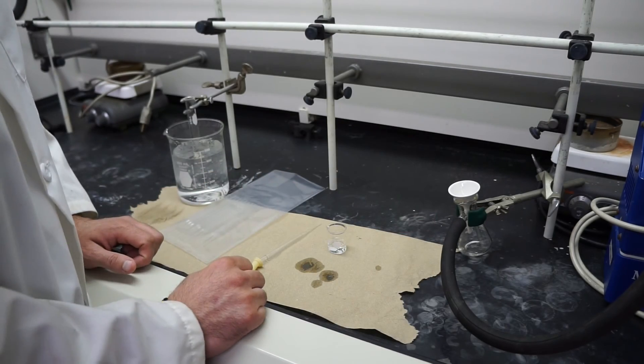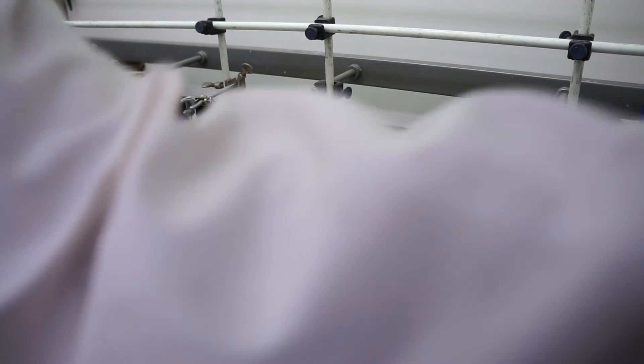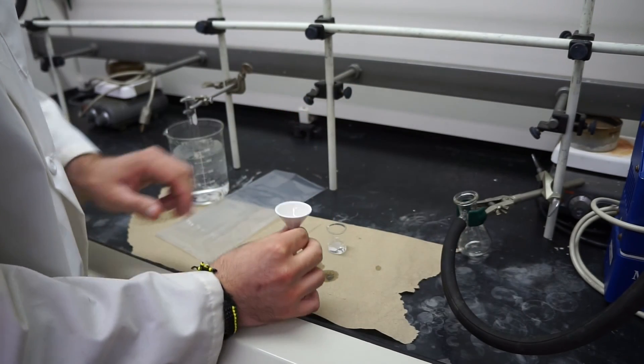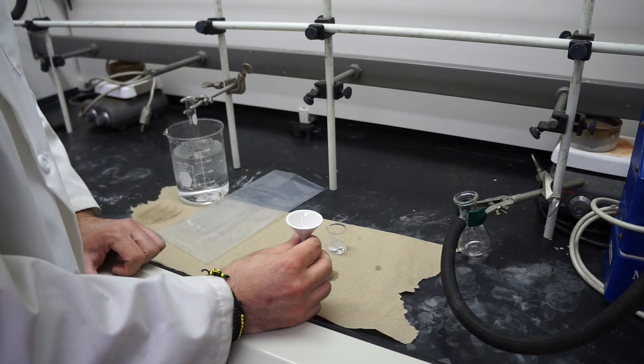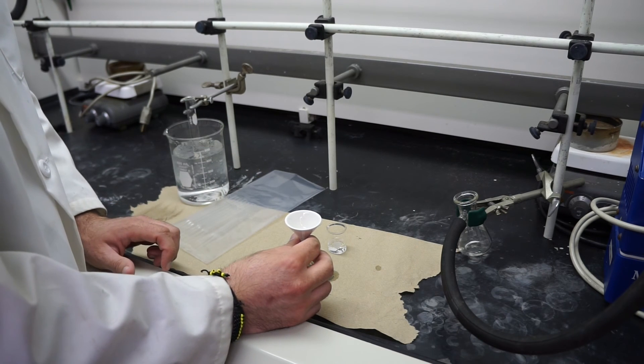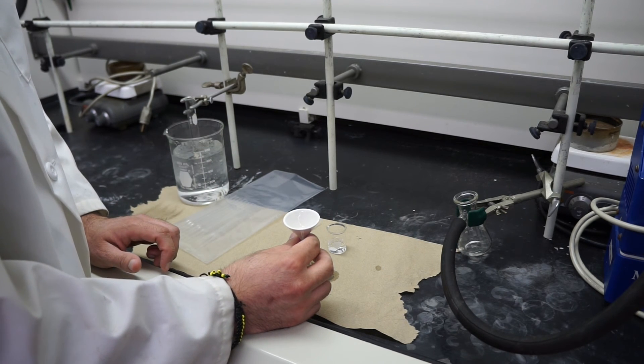Now once you've let that suck dry for about five minutes, you'll turn off the vacuum. You'll go ahead and take this off and make sure you put it in a secure place. And then you'll let it sit for a week and next week you'll take the melting point and get the product yield.